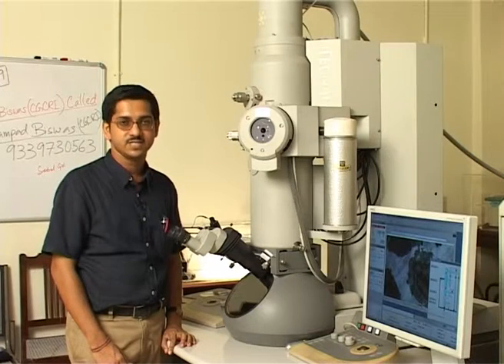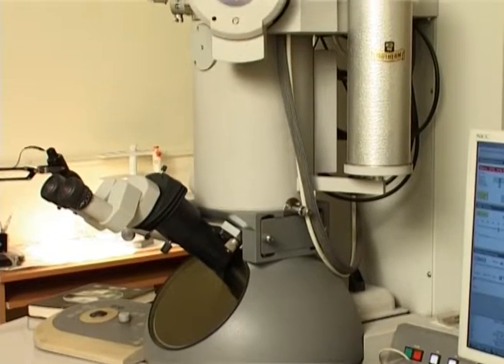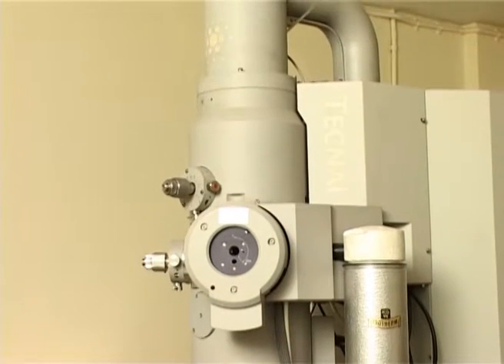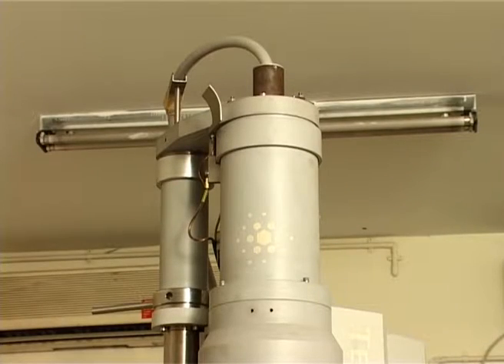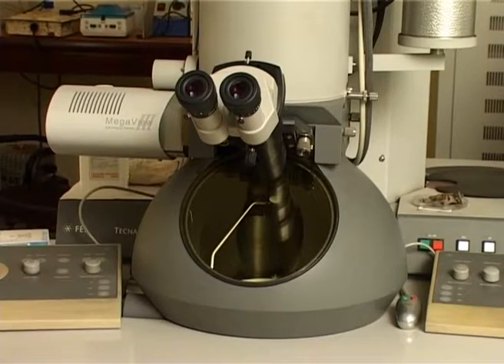Now we are at the TEM facility. What you are looking at is the transmission electron microscope, which is the FEI Tecnai G2 BioTwin. The most important component here also is the electron gun placed at the top, and this is 120 kV. The electrons pass through the condenser lenses, and then you can put your sample in between, and then there is the objective lens, and it gets focused on the screen which you can observe manually.